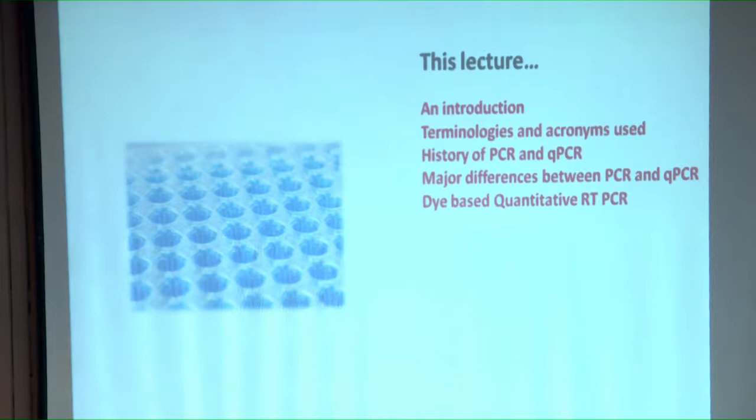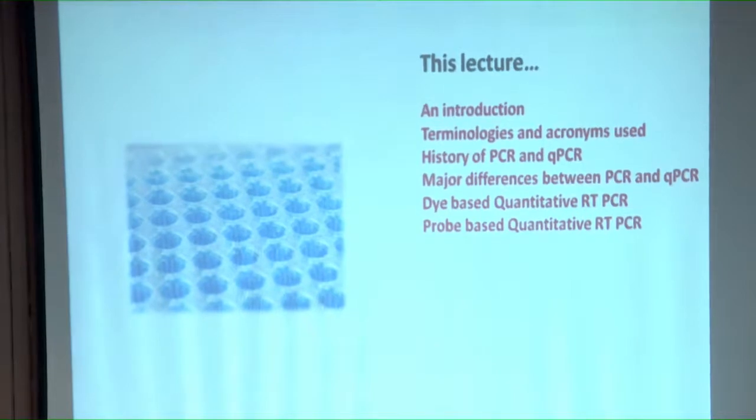And the two of them I would like to highlight here, because those two are really dominating in qPCR research. One is the dye-based qPCR, and another one is the probe-based qPCR. So students, I must make a mention here. When I say qPCR, when I say RT-PCR, I only mean real-time PCR. Okay, you take it in that sense. I'll try to control myself in telling only qPCR, because it's the most preferred choice now. And sometimes you are also forced to say RT-PCR, the real-time PCR, in your discussions and presentations, right?